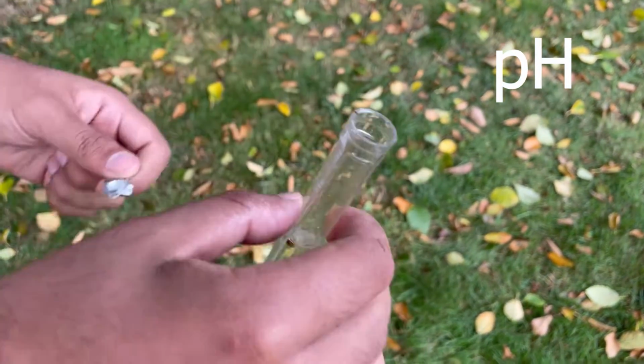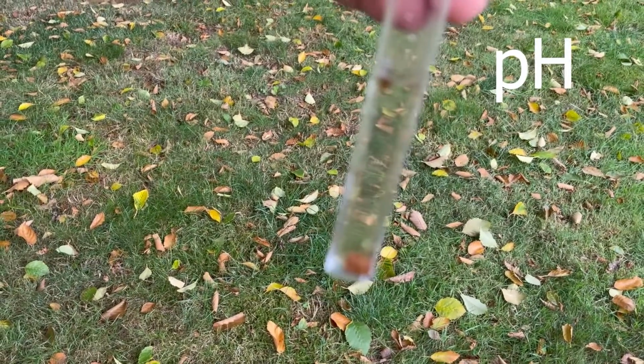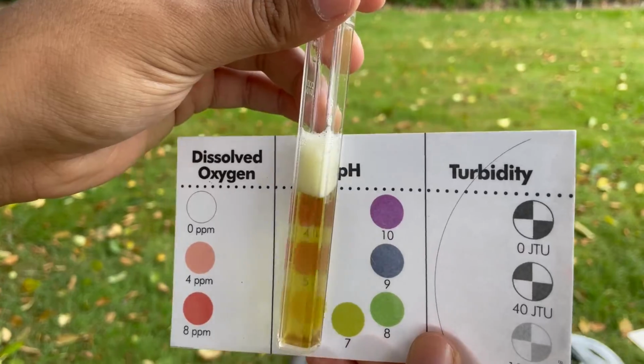Place the pH tablet from the pH testing kit inside of a sample of water from the creek selected. Close and wait for the tablet to completely dissolve until a constant color is shown. Compare the color of the water when mixed with the pH tablet with the pH chart given with the pH testing kit.